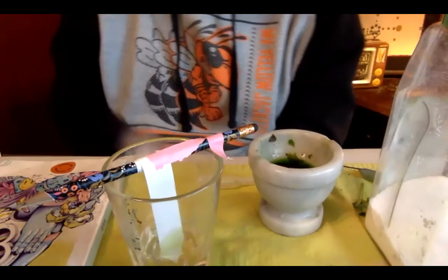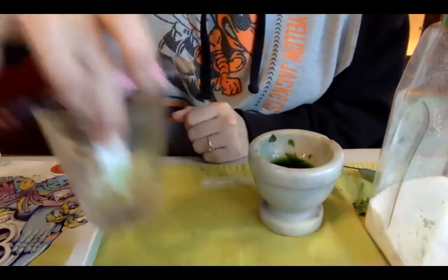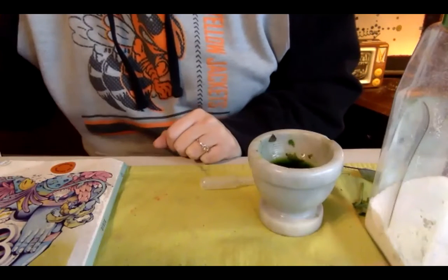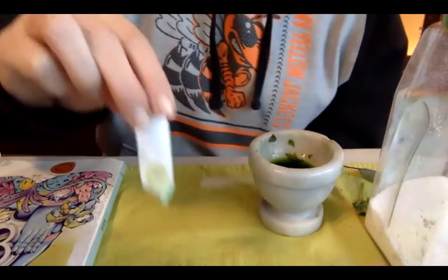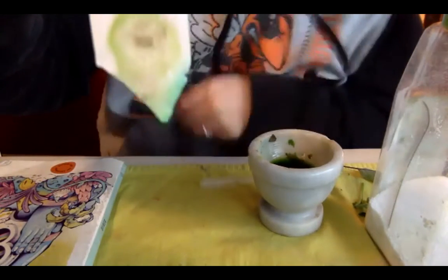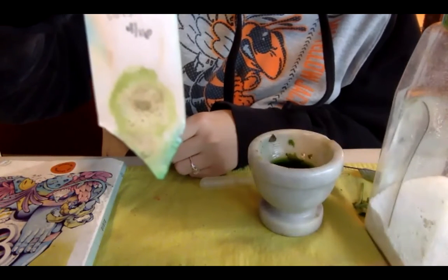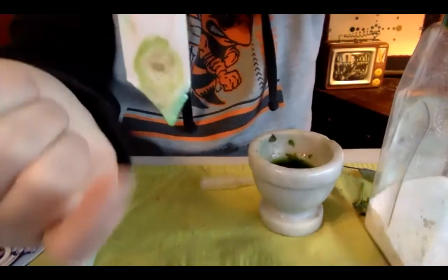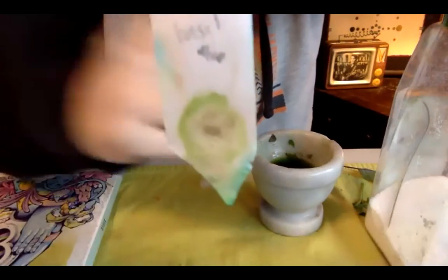And again, you just kind of sit and wait. And in the end, put that to the side and let it do its thing. In the end, I got this. We could see there was some darker brown pigments and then a lighter green. And then this darker green, out sort of at the farthest rims.